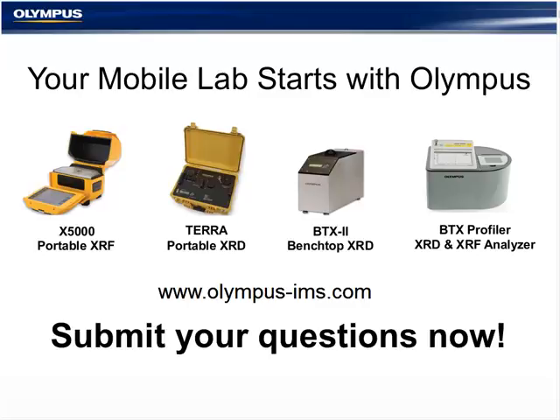I can't definitively give an answer for the right solvent or the right cleaner for every single drilling mud because they're all unique. But if someone wants to email me some questions, I can, after this, give them some recommendations for different choices for cleaning your samples and different types of drilling muds.